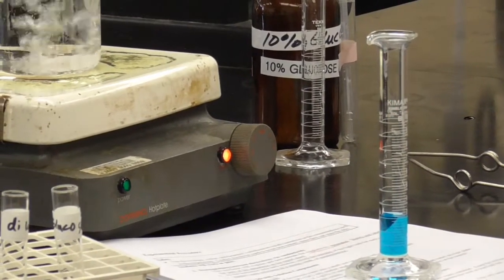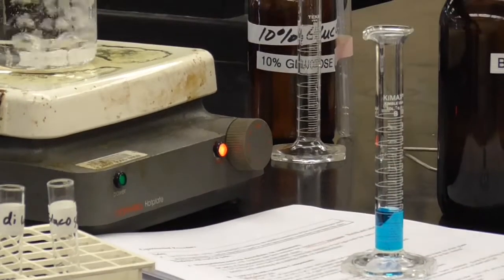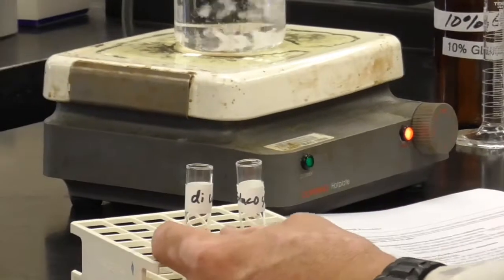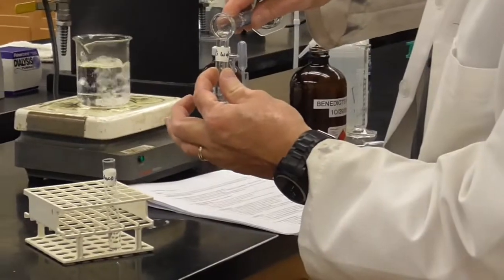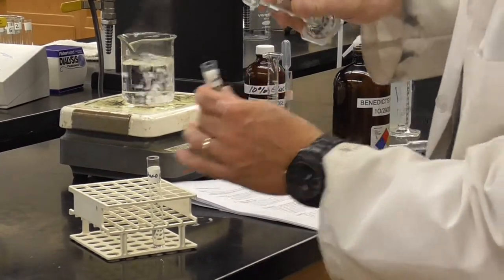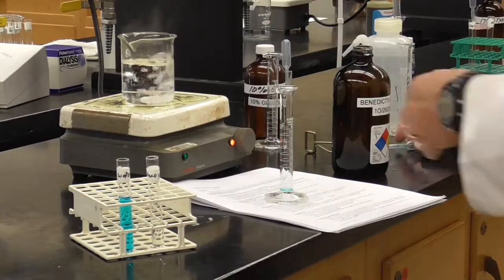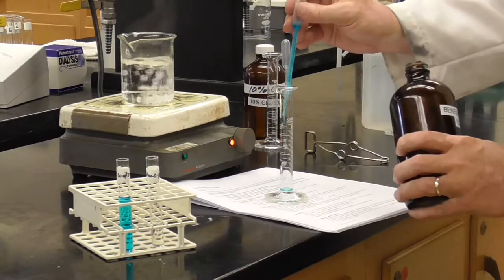That's one thing I've always liked about chemistry. You get beautiful colors in chemistry. Sometimes you get beautiful smells or not so beautiful smells too. But the colors are always great. So we're going to add that to our test tube. This is the DI water, so here's our negative side. And it's just kind of mixed together like that. And now we'll do it with the positive. So 3 more milliliters here.